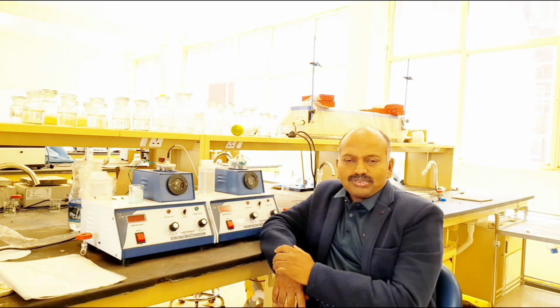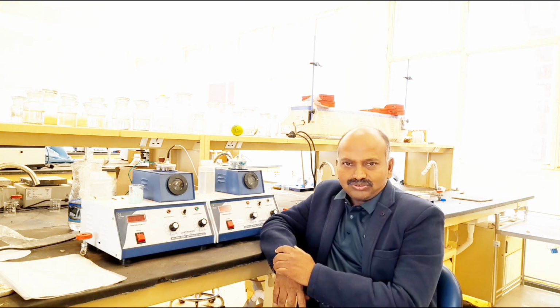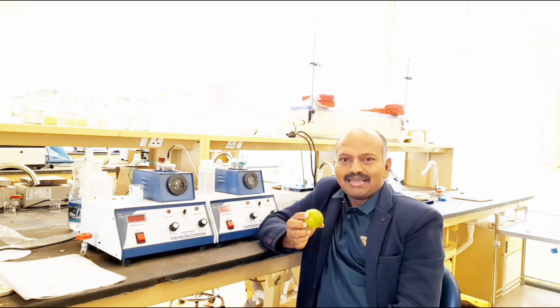Today we'll discuss a very important experiment, that is, determination of citric acid present in lime juice. We can have an example here. This is the lime. We'll determine the amount of citric acid present inside this lime.